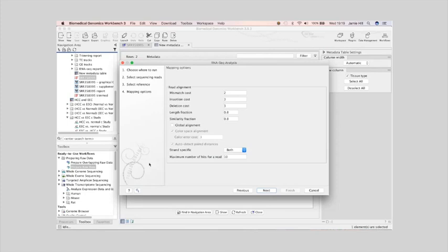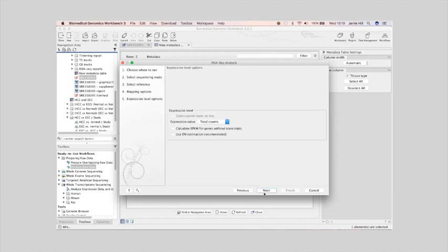These are just alignment parameters for the mapper. It can be fun to play with them, but I normally just use the default ones unless I've got a stranded protocol, when I can set the strandedness here. And then there's some options for how the expression level is calculated. And the only thing I normally do is switch on the EM estimation here.